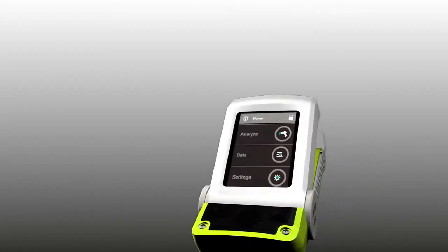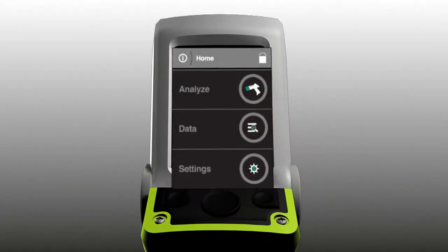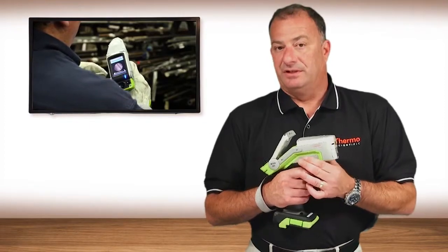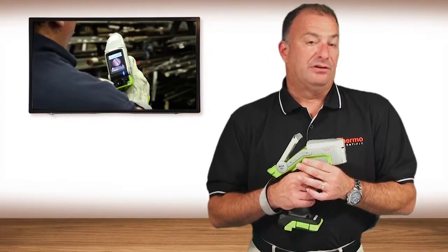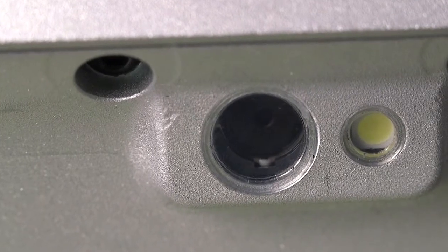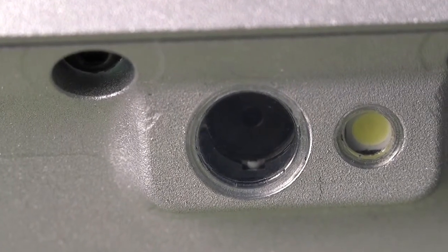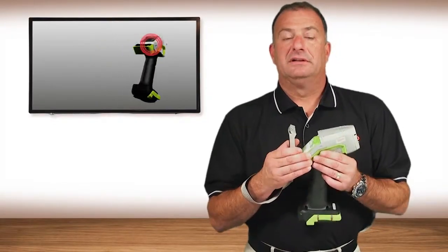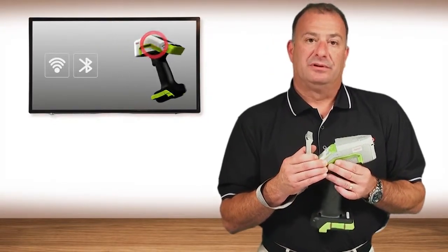It has a new user interface — very intuitive, very easy to operate. Not only is there a micro camera in the nose of the analyzer to allow you to pinpoint a specific analysis location on the sample, it also has a macro camera on the back side of the screen that allows you to capture the sample image. On board within the analyzer is Wi-Fi, Bluetooth, and GPS.